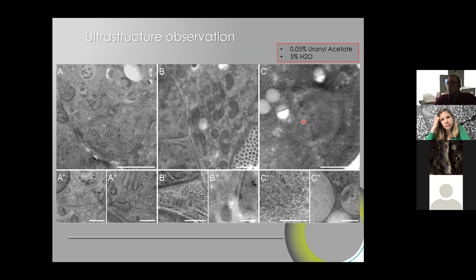Now, one key thing was the quality we could get. How does it preserve the ultrastructure? How does it behave in the microtome? So this is a wide example. This one is melanocytic cell lines, so MNT1 cells, in this resin. There are very dark patterns, but we see that we have a very homogeneous contrast and it's nicely contrasted.